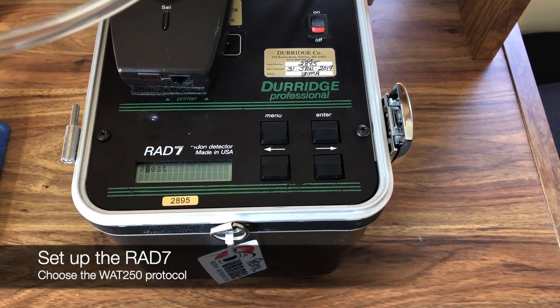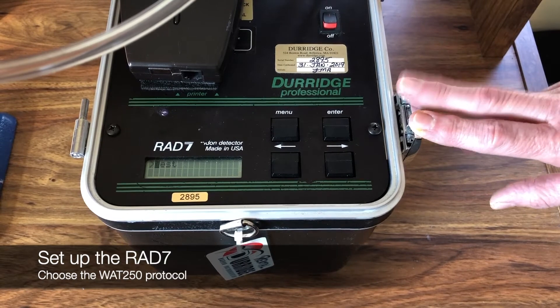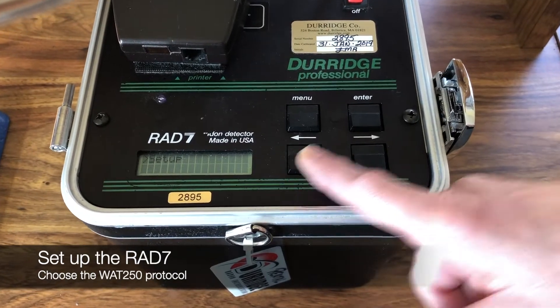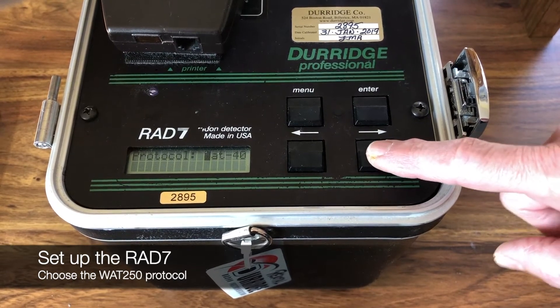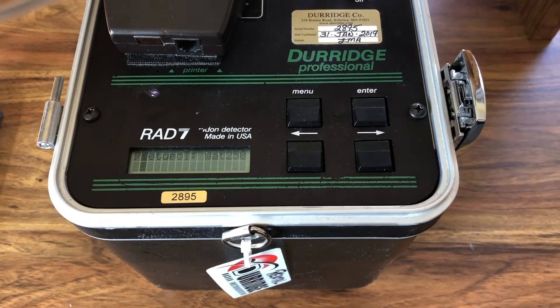Now we're going to set up the rad7 to do a 250 milliliter radon in water test. Go to menu, go to setup, and enter. For the protocol, because this is a 250 milliliter bottle, we're going to select watt 250. Hit enter.